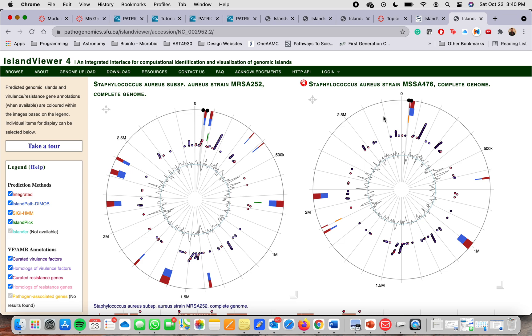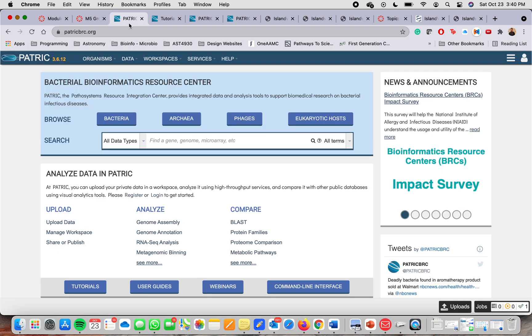If you have more information, you can go through the user guide. The other tool is the Patrick tool. The Patrick tool is the Pathosystem Resource Integration Center.